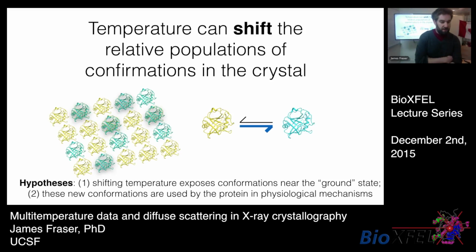And we think that this is really important because conformational dynamics is one of the impossible things to really get a structural basis on. We have really powerful solution-based tools for examining or determining whether there are conformational dynamics occurring. But it's very difficult to simultaneously figure out whether there's conformational heterogeneity and reveal what structures the protein is sampling.